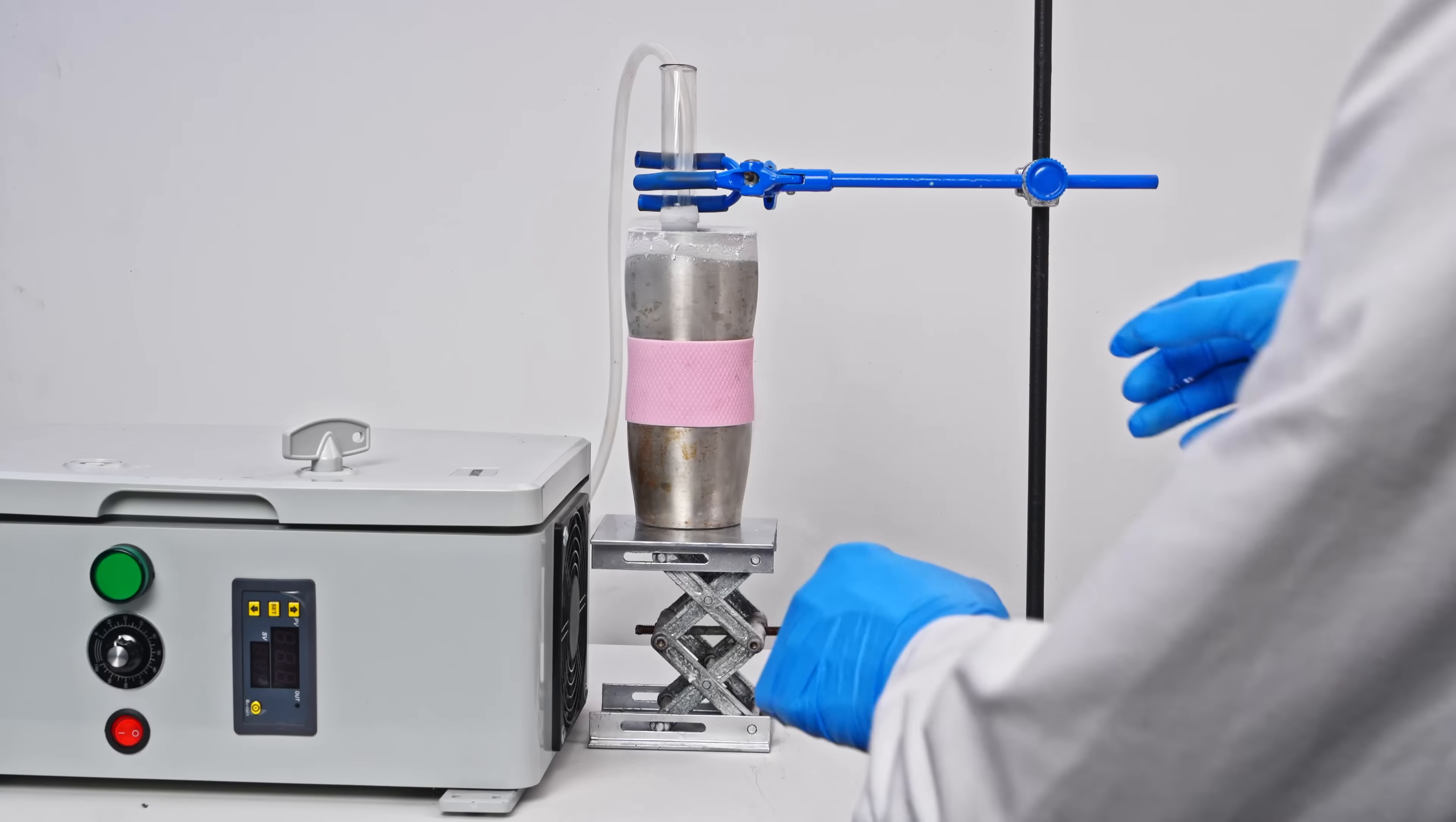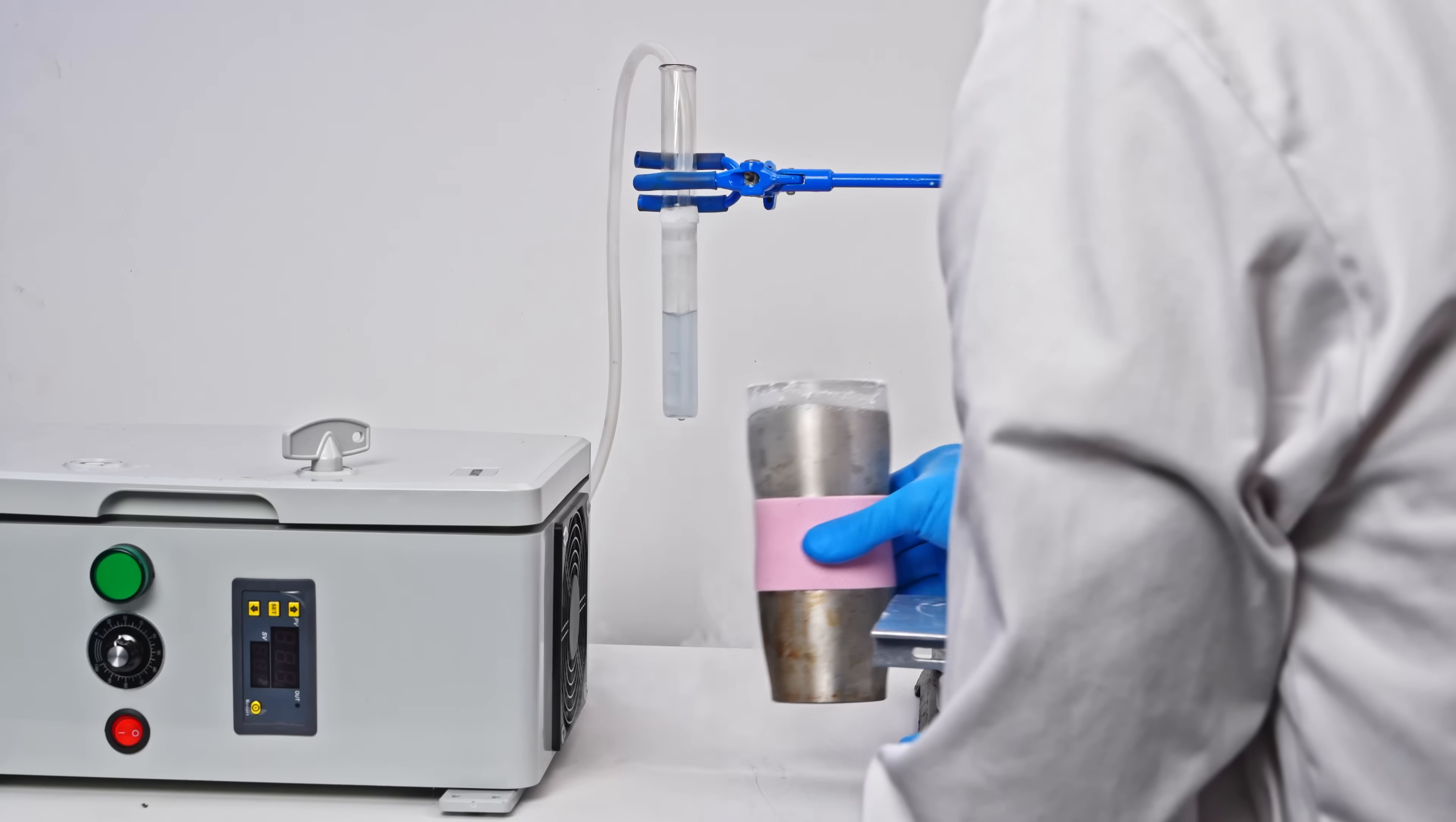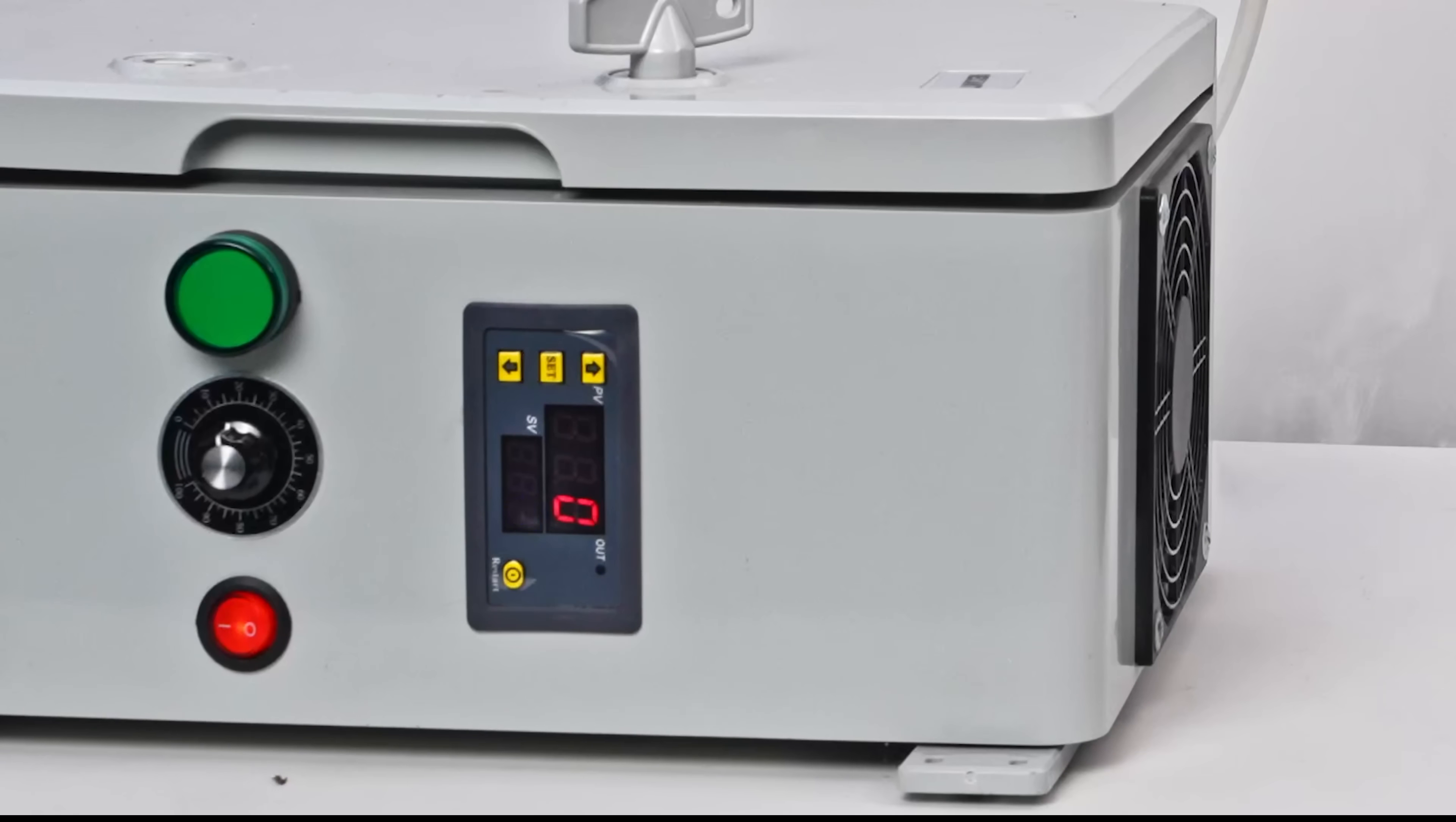Right now the ozone generator is off, and I've passed oxygen through it, condensing it in a test tube. You can see the pale blue color of liquid oxygen. Now I'll turn on the ozone generator, and you'll notice how the liquid oxygen's color becomes more intense.